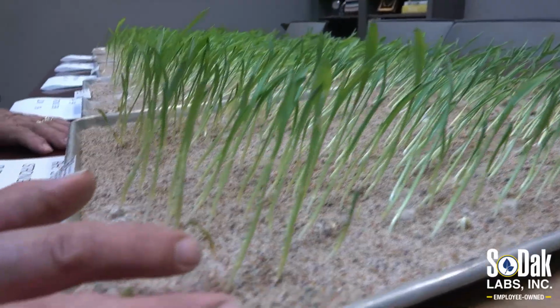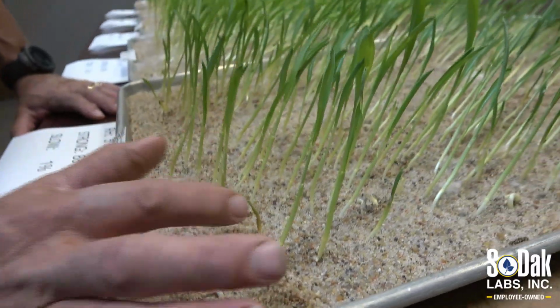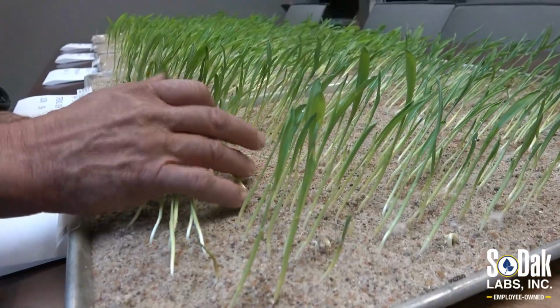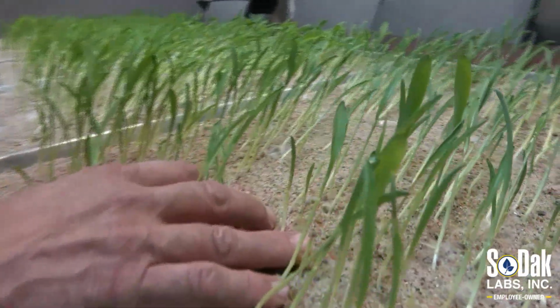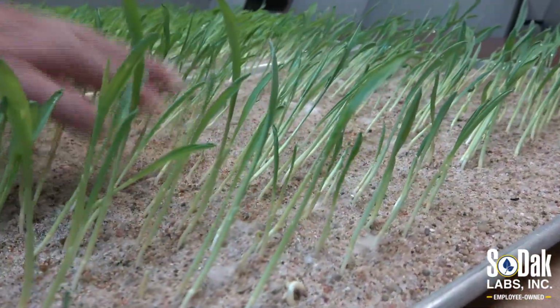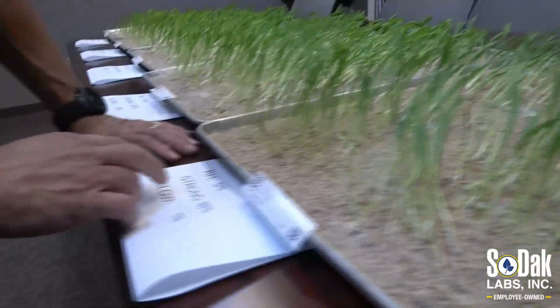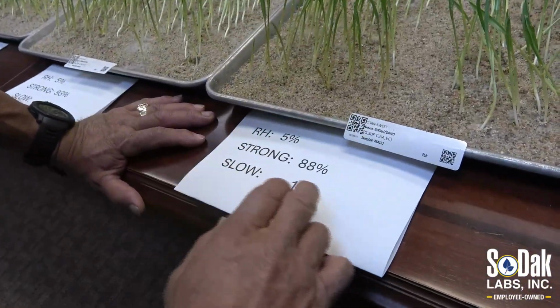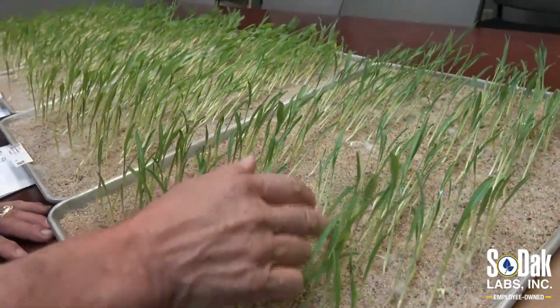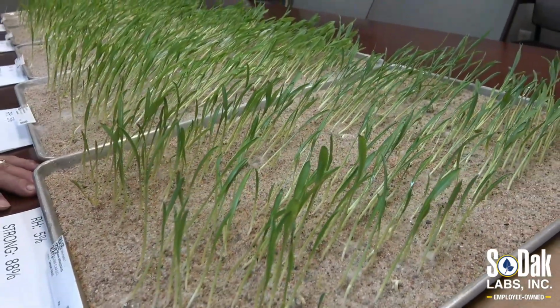As you can see here in this first tray, we have pretty uniform water uptake, but you see some variability in seedlings. Strong and slow. And so sand allows us to do that classification. And on this lot here, we're saying 88% strong and 1% slow is the average. We're looking at this at about 7 days after being planted.